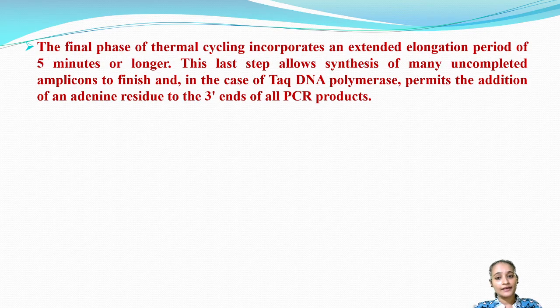We carry out this final phase to make sure that any single stranded DNA which is not extended properly in the extension step gets further extended.